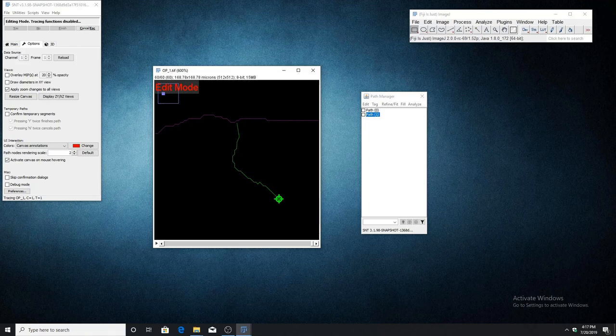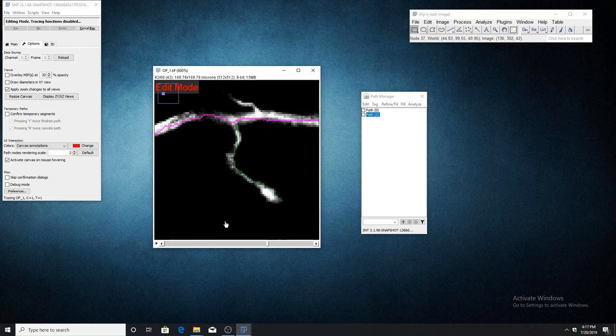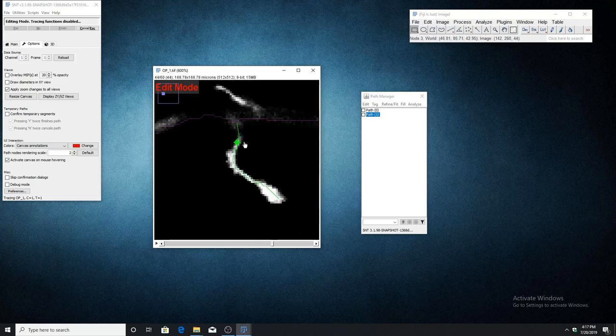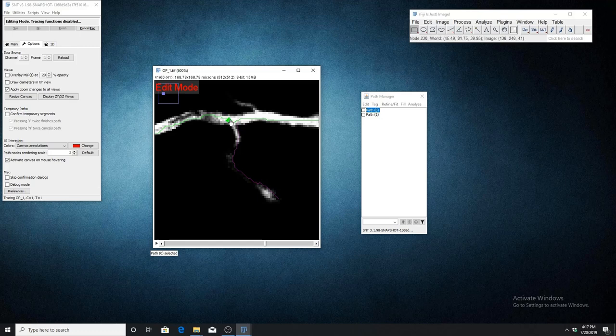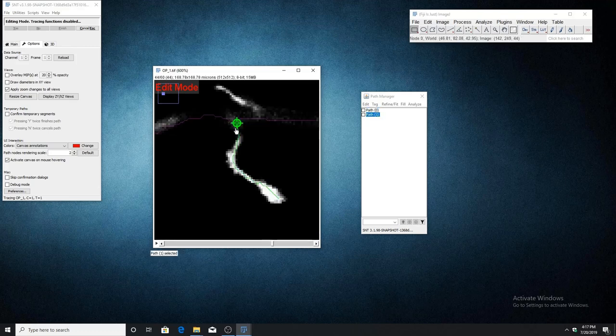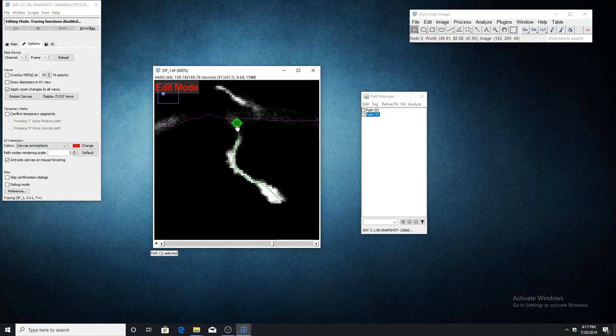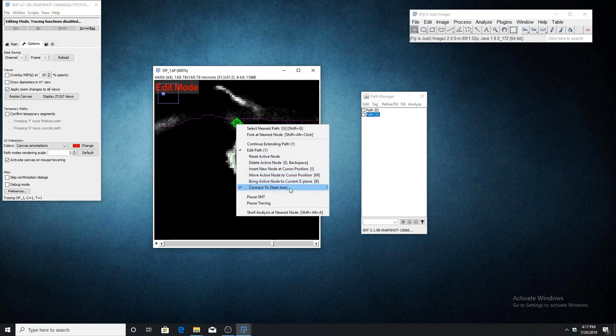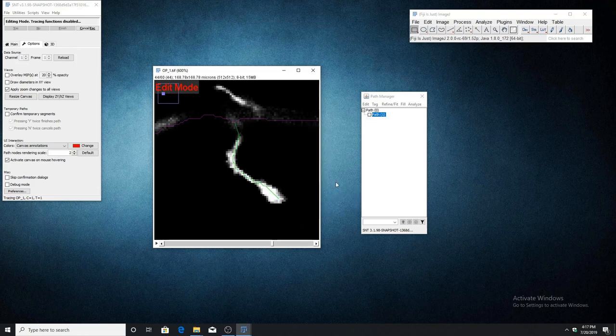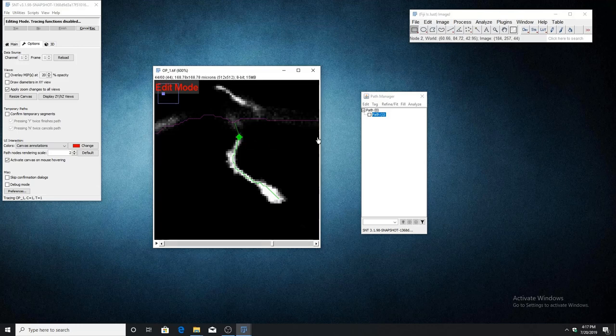The last thing I want to go over is how to merge two existing paths. To do this, first select the path that you want to merge from and highlight the node you want to merge from. Then select the second path you want to merge to and activate the node you want to merge to. Open the right-click menu, go down to connect to and choose the first path. Now these two paths are merged together and path one is a child of path zero.